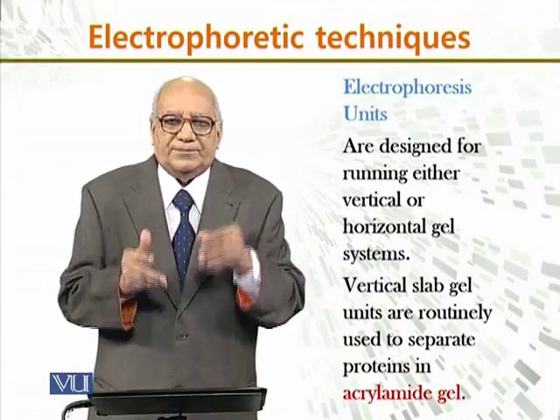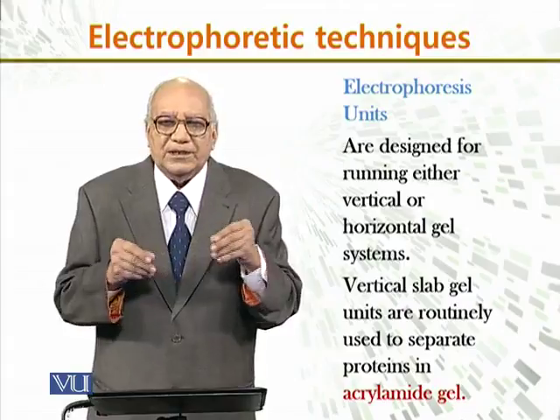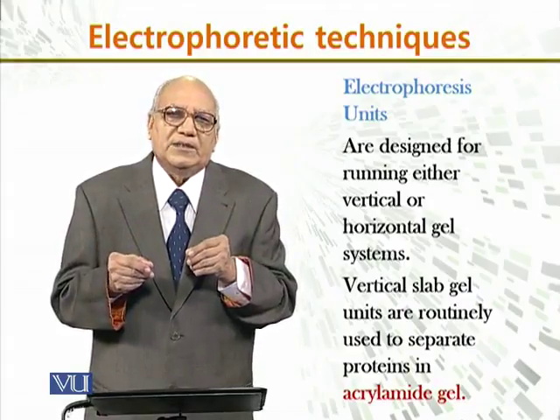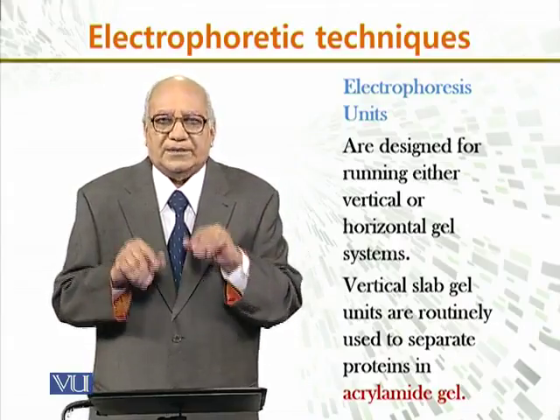Now, vertical slab gel units are routinely used to separate proteins in acrylamide gel. So you see, there are vertical as well as horizontal gels.